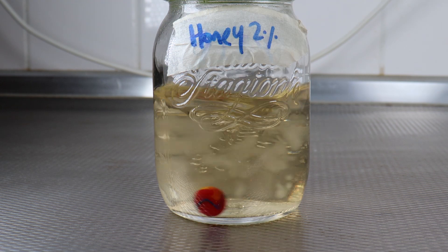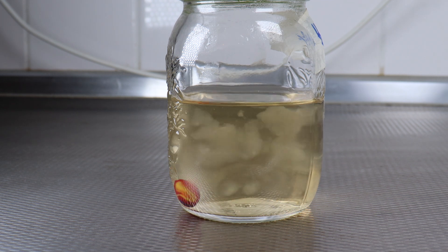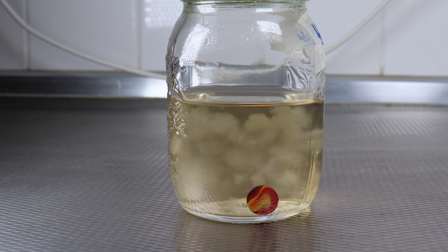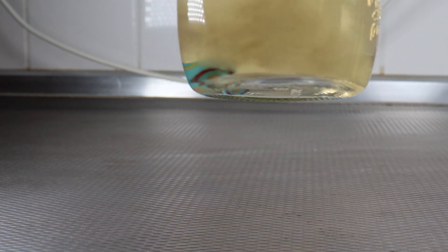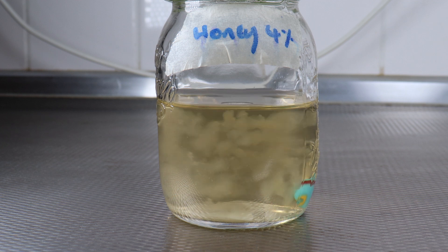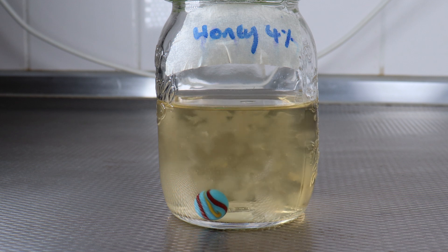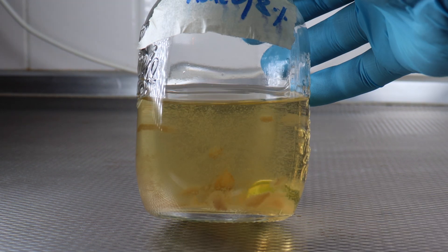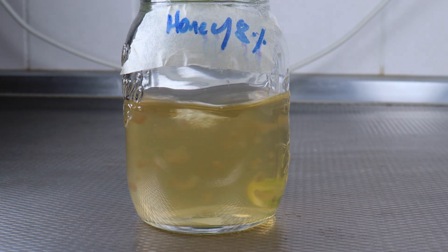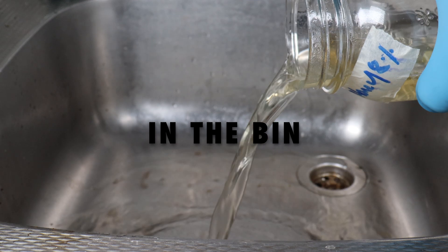Here's the two percent honey — finally catching up. Lots of beautiful culture in there, finally growing. A little bit more sluggish than the corn syrup, but plenty of culture to be had. Much the same with the four percent — a little bit more than the two percent honey, quite a bit more actually. Growing very nicely. Slower than the corn syrup, but we got there in the end. And that eight percent is not looking so good — a little bit of growth but it's so sluggish, and I don't think we're going to get much more than that. So in the bin it goes.